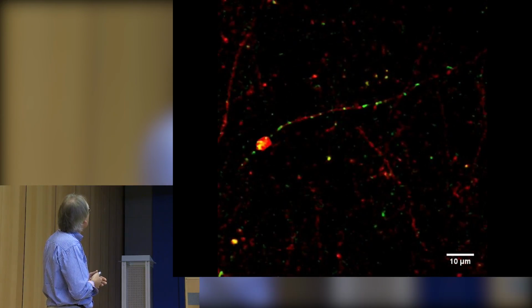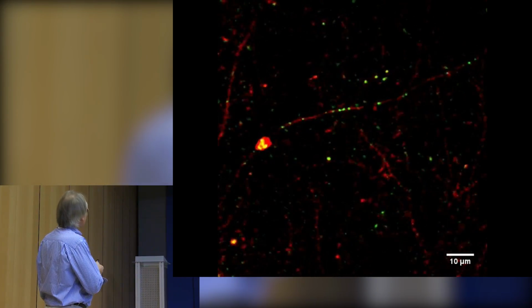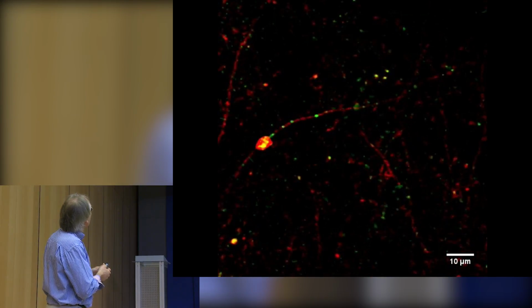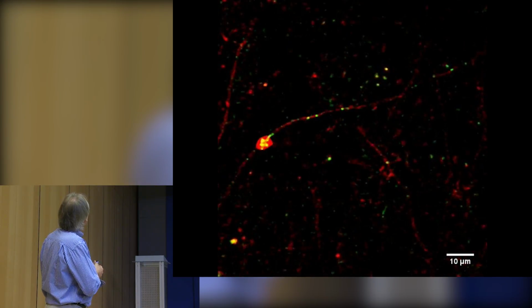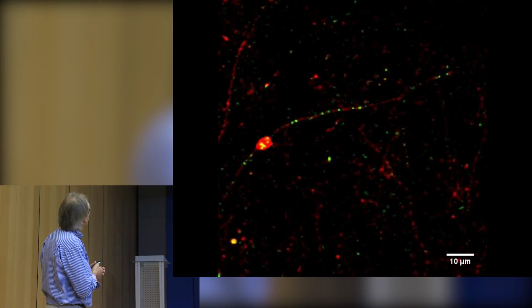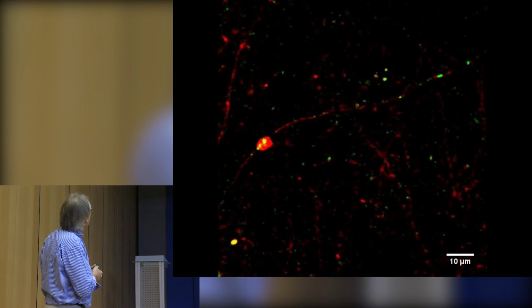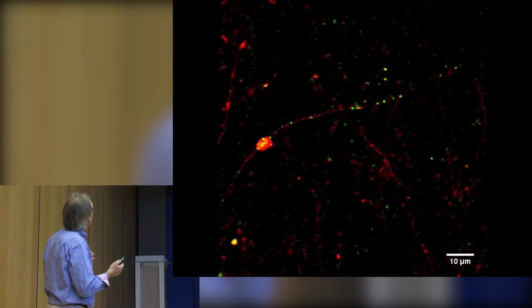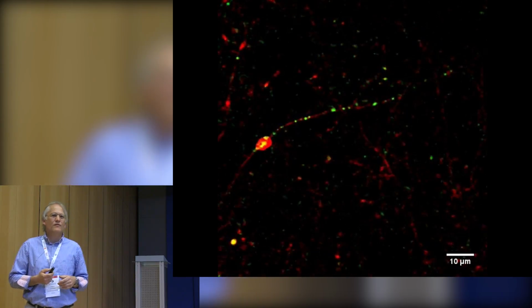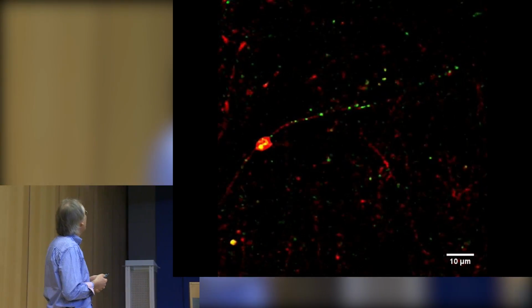So we did a time lapse where we recorded vesicles once a second, so at 1 hertz, and you can see how these vesicles go in both directions through that axon. There's another one here. You can see that they sometimes pause, and then they keep going. You can see there are sort of traffic jam areas, like one could see it here, where vesicles from both sides come and then briefly stay, and then they continue. So that's what's going on in your brain right now in zillion-fold times, exactly like this.